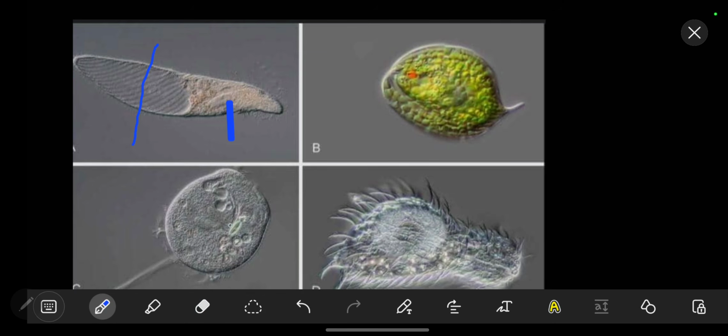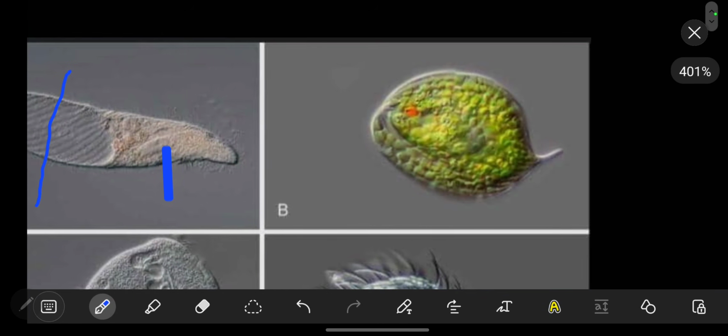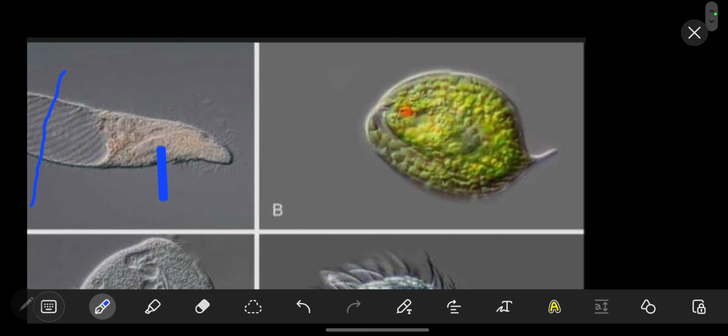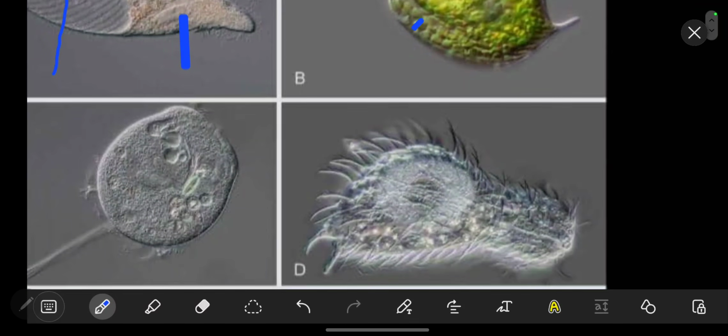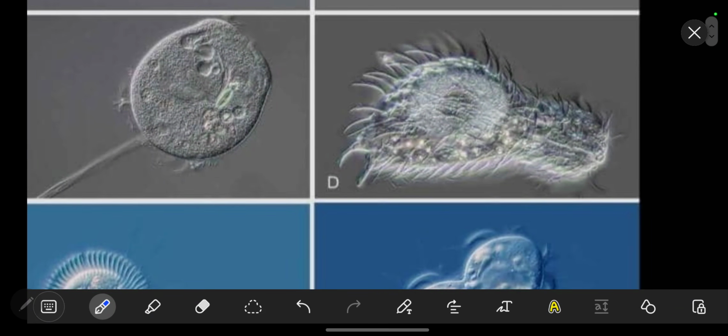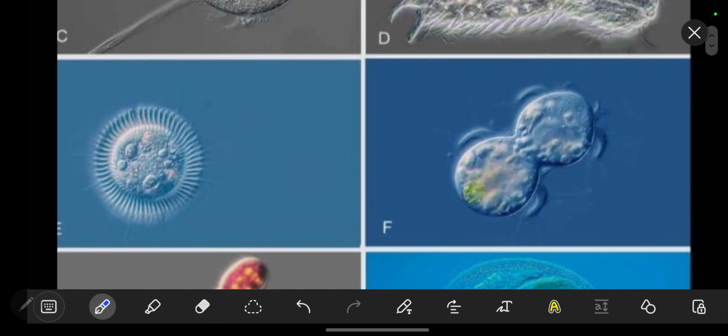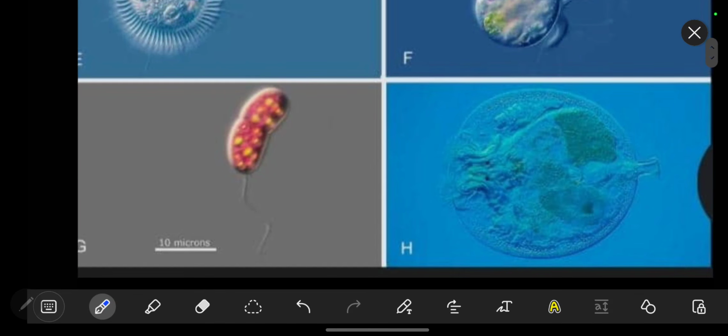So this is how the images in DIC look. We even have images like that. We can look at these other images. As you can see how the contrast is looking, where the light was passing faster, it looks less thick as compared to the other parts. You can even see the holes and everything. So this is how the images in DIC look.